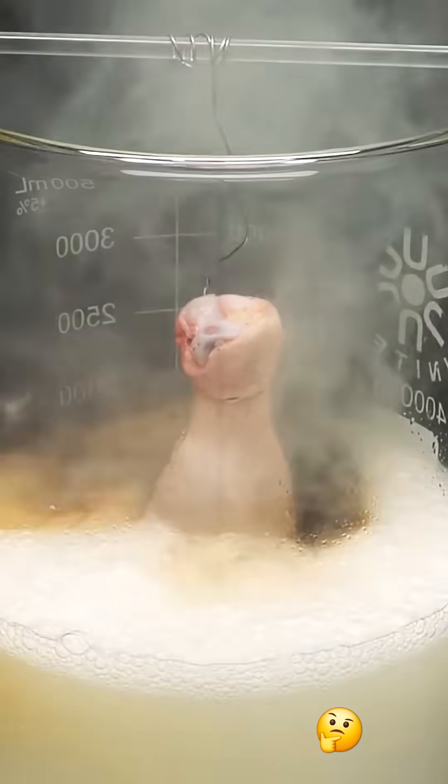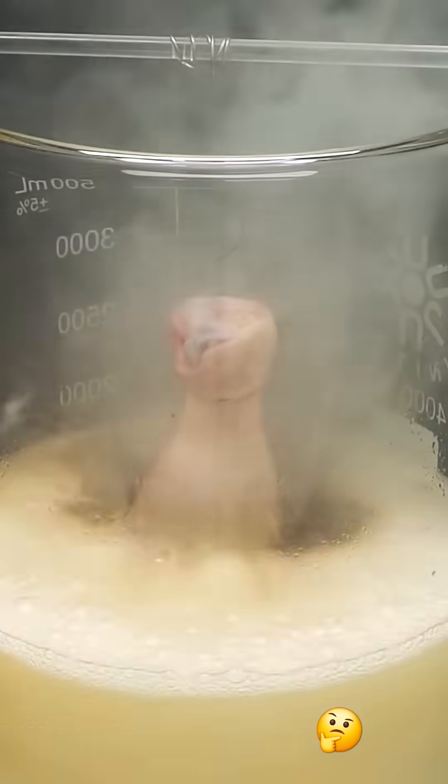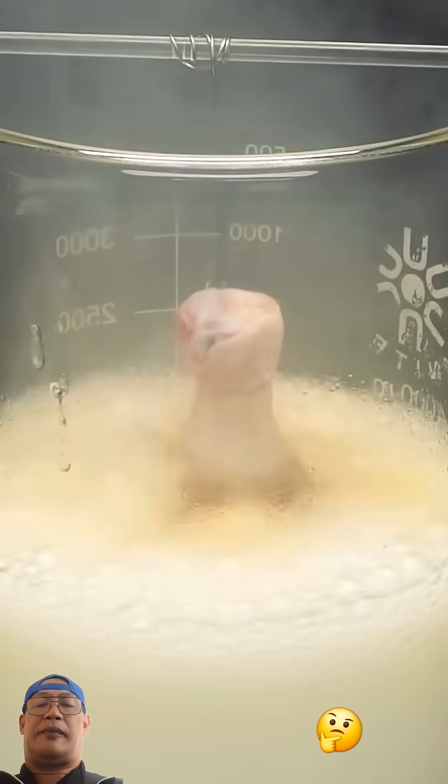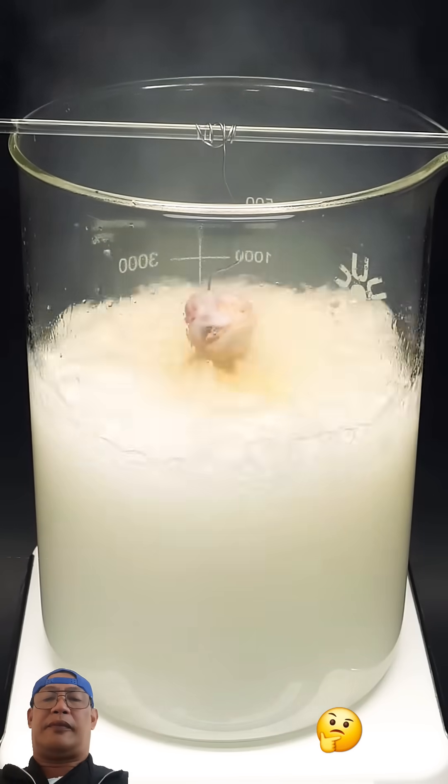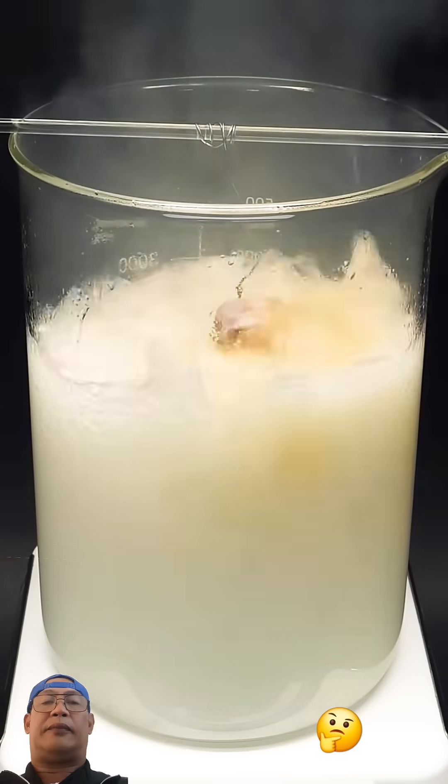Almost immediately it started bubbling, and the reaction slowly got more and more violent. I was a bit worried that it would spill out of the beaker, which would have been a huge disaster.